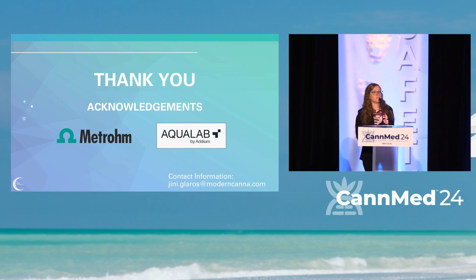Right, so I think the difference here is this is focusing a lot on the moisture techniques that laboratories are utilizing. The growers and the cultivators are drying their flower in much different ways. They're not using any of these techniques. It's more about the laboratory and how they are providing data to the producers and growers to know how wet or how dry their flower is. When we talk about aerosol testing, that's a whole other monster that I think still has a lot of kinks to work out before we see any labs doing it successfully and at a high scale.